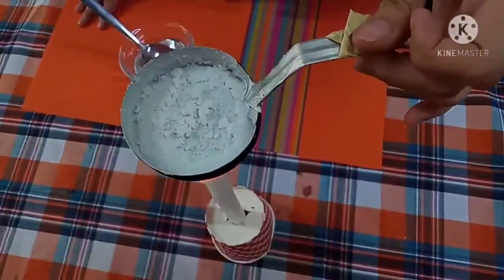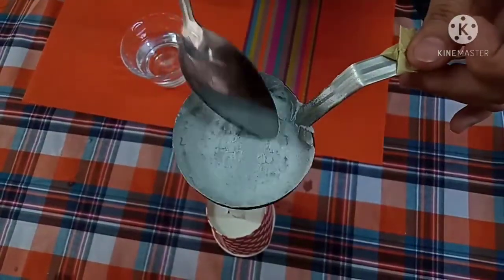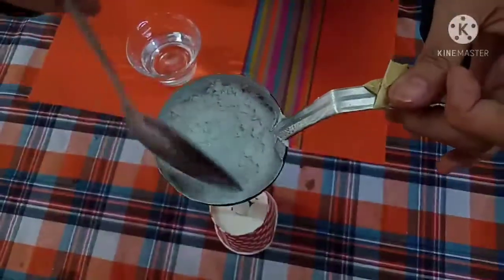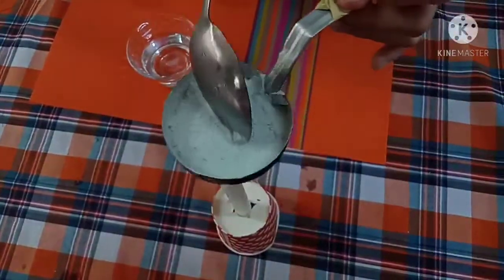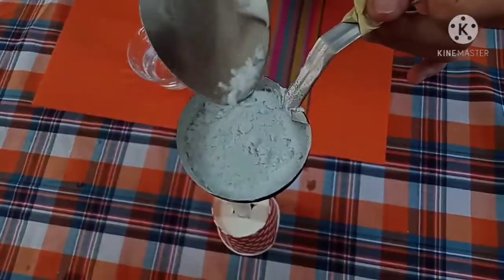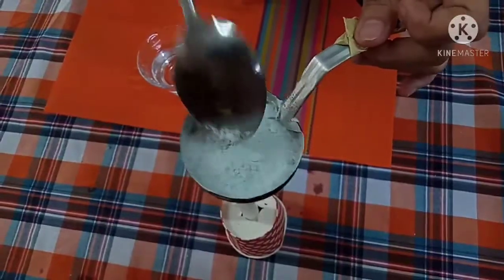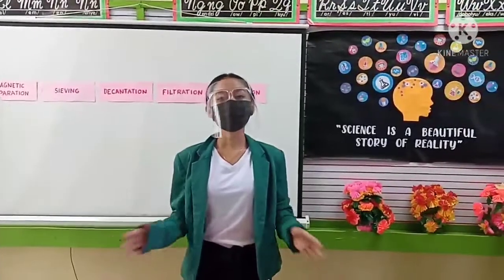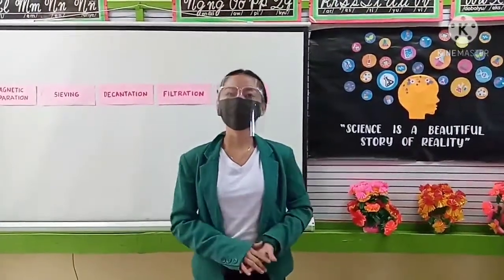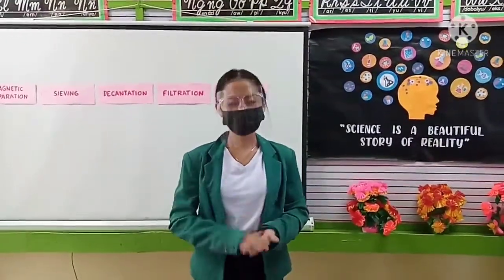So this is what happened after boiling the mixture of salt and water. This is what it looks like now. The smoke from the mixture is the water turned into gas. So basically, the water in the mixture does not disappear. It just became a gas called water vapor. And that's evaporation. So again, class, as I discussed yesterday, evaporation is used in separating a soluble solid from the liquid with the use of heat.